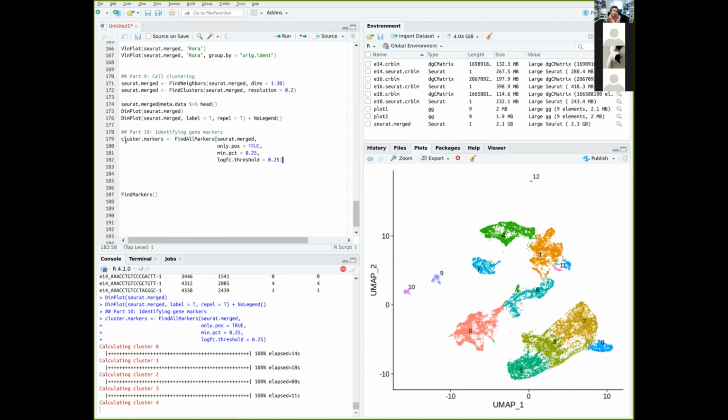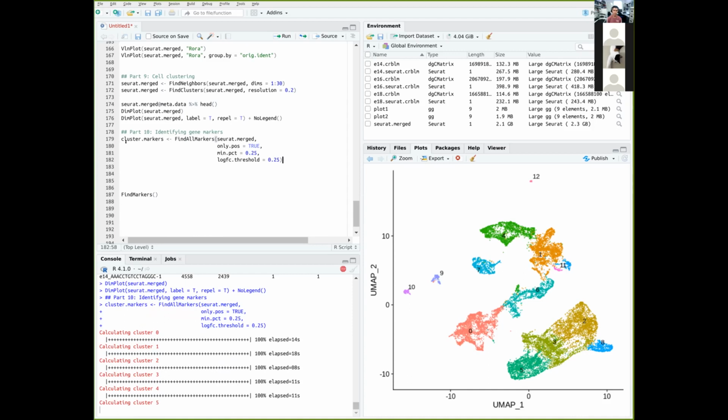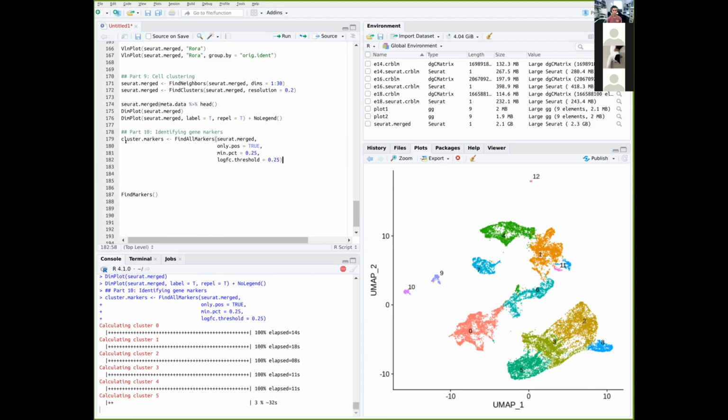There's no right or wrong here. I had this conversation with a couple of people. There is no one answer. I cannot tell you to choose, let's say, 50% or one fold change. It's difficult to set a particular value because different experiments require different filtering parameters. So you have to eyeball this, look at your data set, plot out, basically use certain reference genes and see if the values are more biased towards that cluster that you expect it to be.